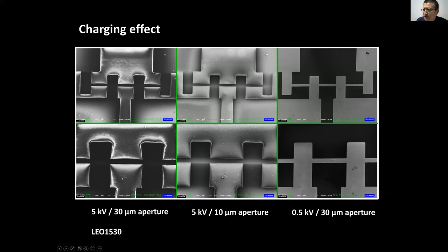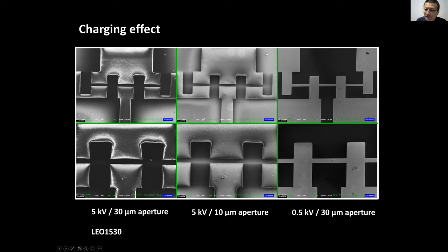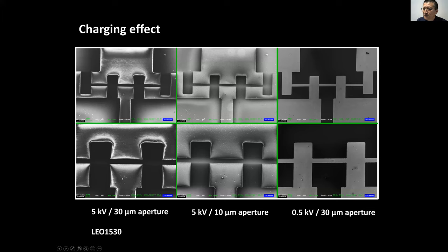When you reduce the aperture size, you allow fewer electrons through, which helps with charging. But the best approach is to reduce the voltage while keeping the same aperture — the charging completely disappears, and you can image the sample without coating. Reducing aperture size passes fewer electrons, reducing the charging artifact significantly.